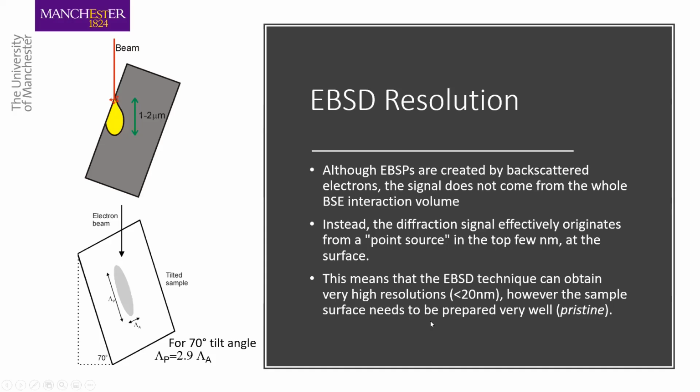This is a disadvantage, but the advantage is, of course, that you get a higher backscatter coefficient, and also because you've tilted, your signal is coming from the near surface, so your resolution depth-wise improves, but in Y reduces. So there are advantages and disadvantages, and it's up to you to judge which is more important when you're doing your analysis, whether tilting a little bit less might be better to improve the resolution in Y or not.